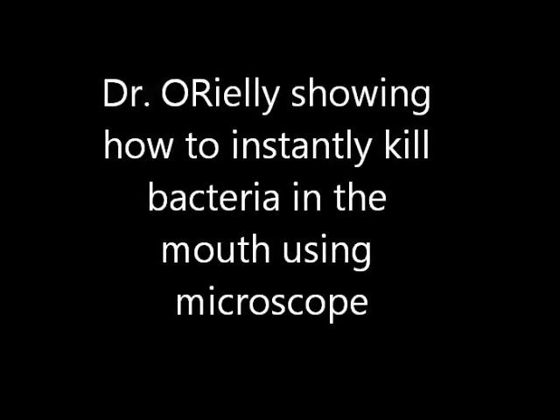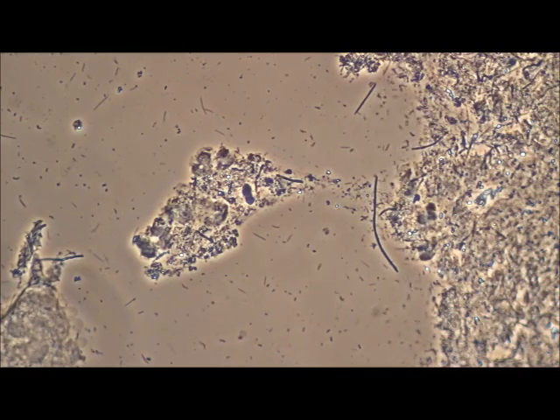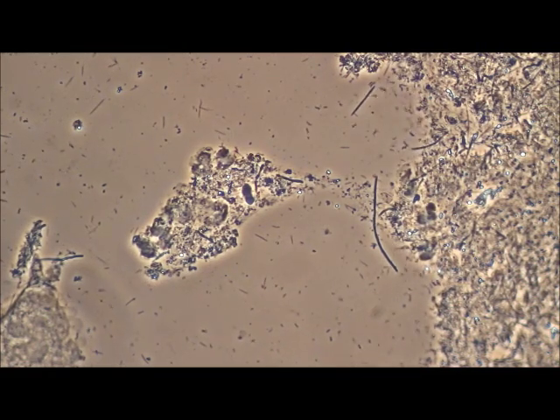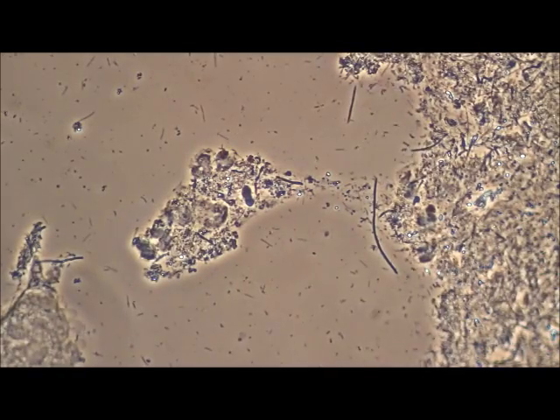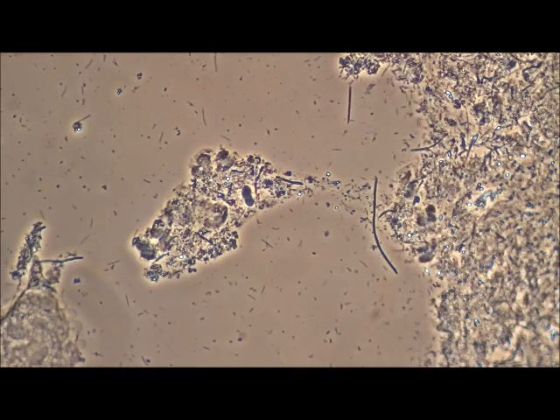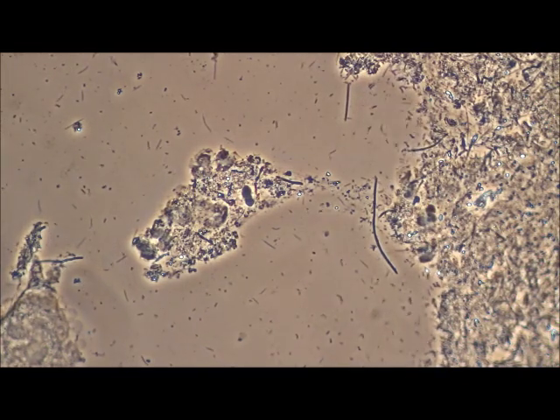Hi, this is Dr. O'Reilly again with another plaque sample showing a lot of bacterial activity under the microscope. What I'm showing here is a solution that I applied to the slide. You'll see the movement across the slide in just a minute showing the antibacterial action on the bacteria in this sample.